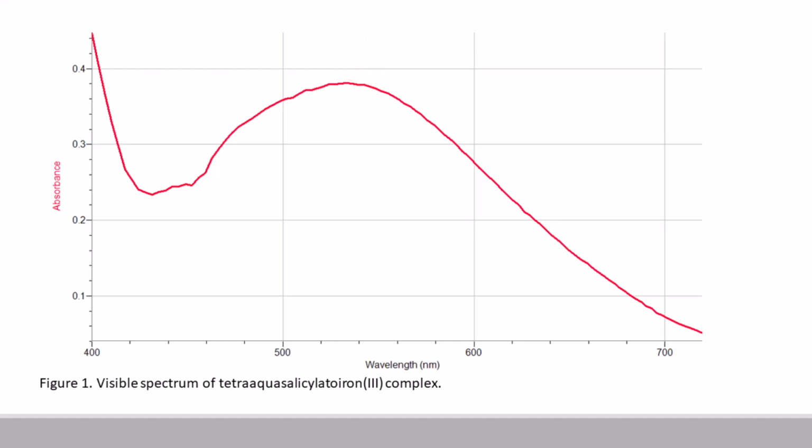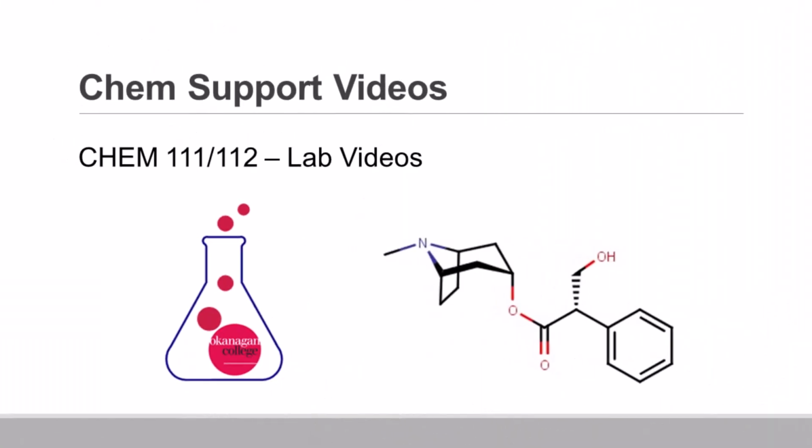Hopefully this video has helped to clarify the steps involved in the spectrophotometric analysis of the mass of acetylsalicylic acid in a commercial aspirin tablet.